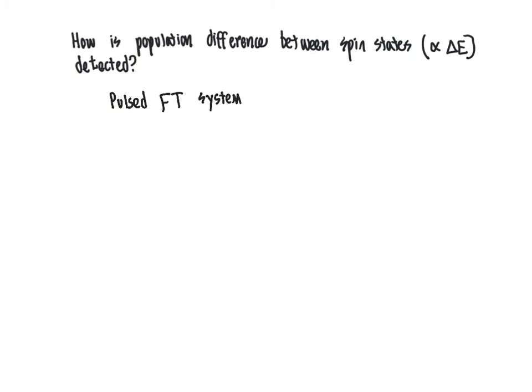And the way that this works is that the sample within an NMR tube, a skinny long tube that goes into the NMR spectrometer and has your compound of interest, which I'll put in gray here, within a deuterated solvent, a solvent that rather than having a standard common isotope of hydrogen, instead has a hydrogen 1 replaced with deuterium.